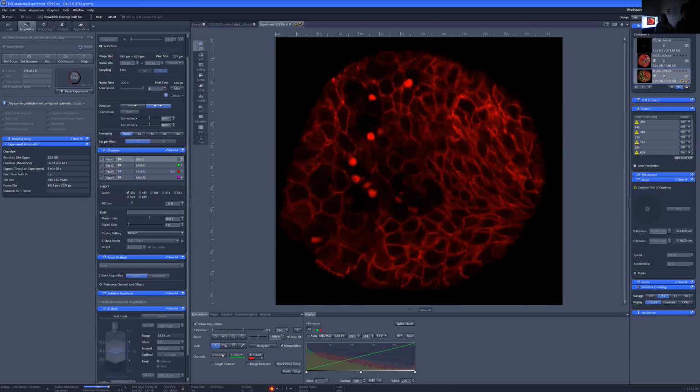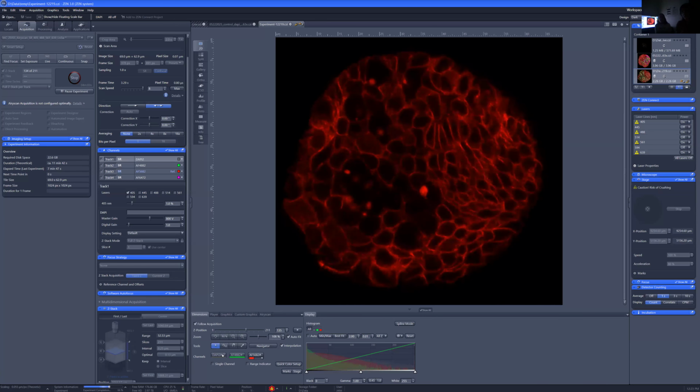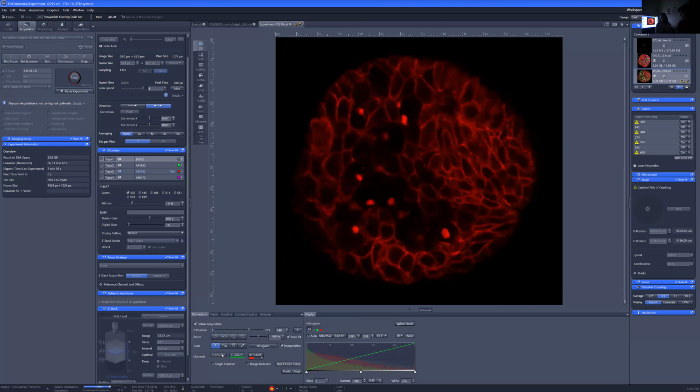But it was recommended to me by someone in my lab that this could be a really good place for computer science techniques to actually be able to take in the image and automatically count the number of egg stem cells based on really high expression of the pink signal of magenta.